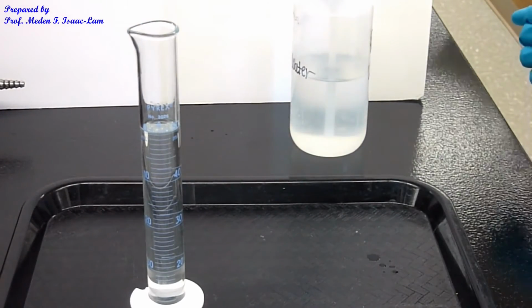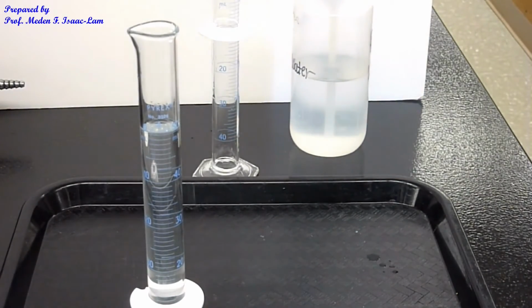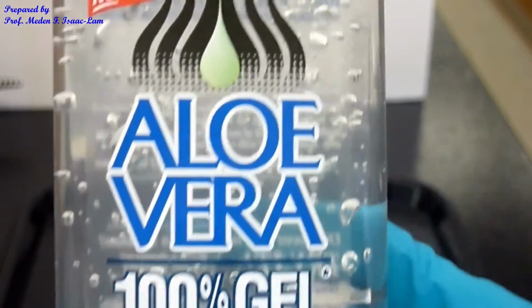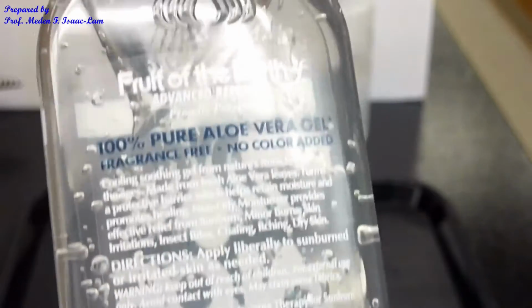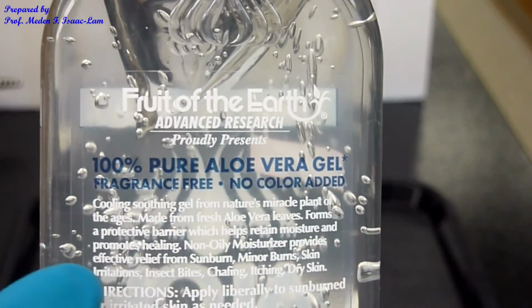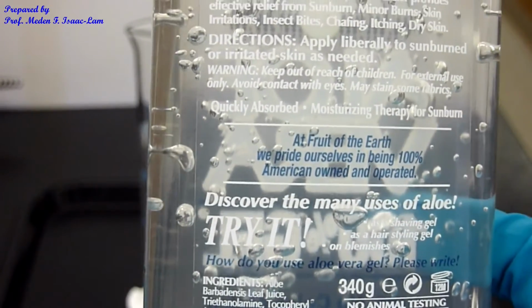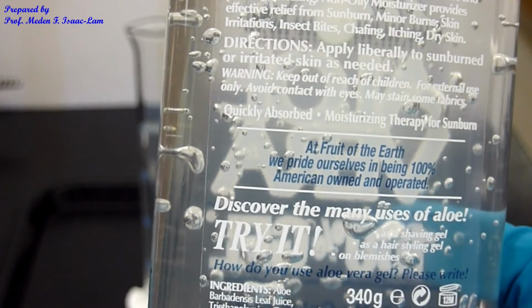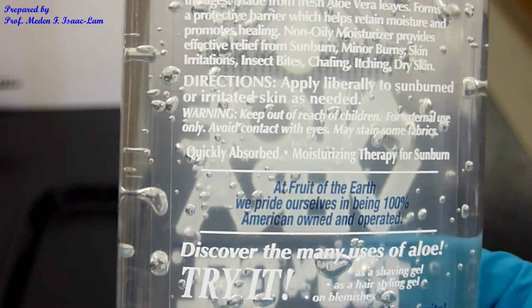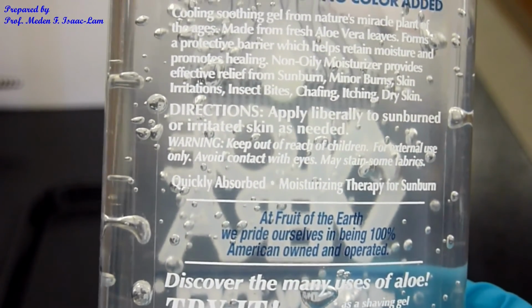And then I have here an aloe vera gel. I bought it. So this is the aloe vera gel, 100% gel. If you read the label at the back, they say that it's 100% pure aloe vera gel. It's fragrance free, no color added. Although if you read the fine print here, they actually added more stuff. So it's not entirely just aloe vera gel. There's tocopherol acetate, triethanolamine, and EDTA. So they have more chemicals that they added.